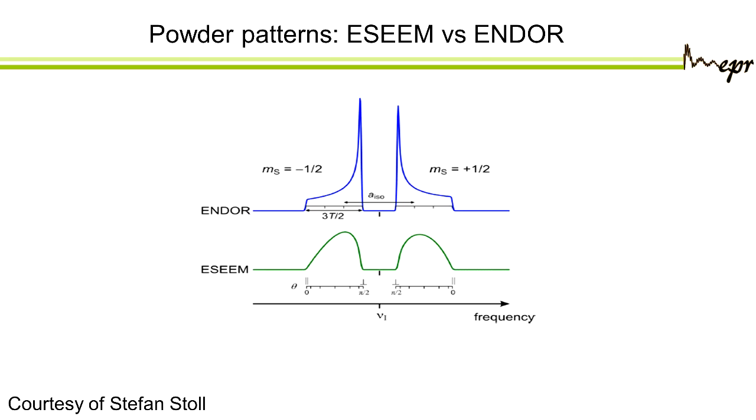So that's why sometimes you still rather look at the ENDOR and get nice line shapes. But from this, immediately I can say, oh, I have a coupling of about, I can read from the maxima of these two spectra. So this is something to remember. Also, ELDOR-detected NMR, the intensities will be like this because they depend on the B term.